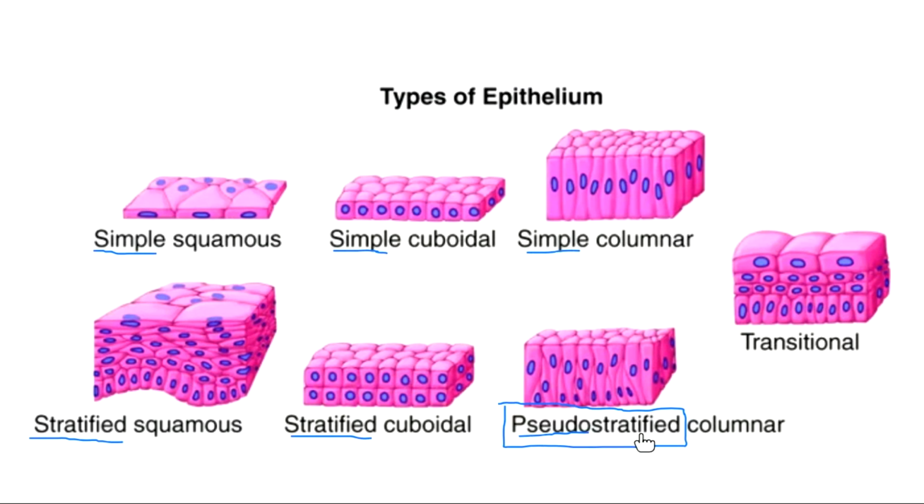When you look at it, it's pretending that it has more than one layer, but there's actually only one layer of cells. The way you would tell that cells are arranged in a layer, by the way, is by looking at their nucleus. See these purple dots that I can see right here? These purple dots are the nuclei of my cells. So when I see them arranged in one line and only one line, that tells me it's a simple epithelium. When I see them arranged in 2 lines, for example here, or I see lots of different lines of cells here, that's a stratified epithelium.